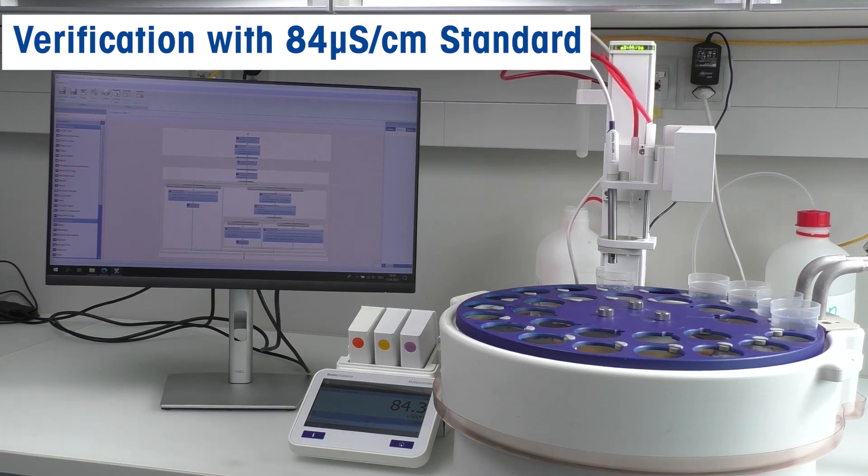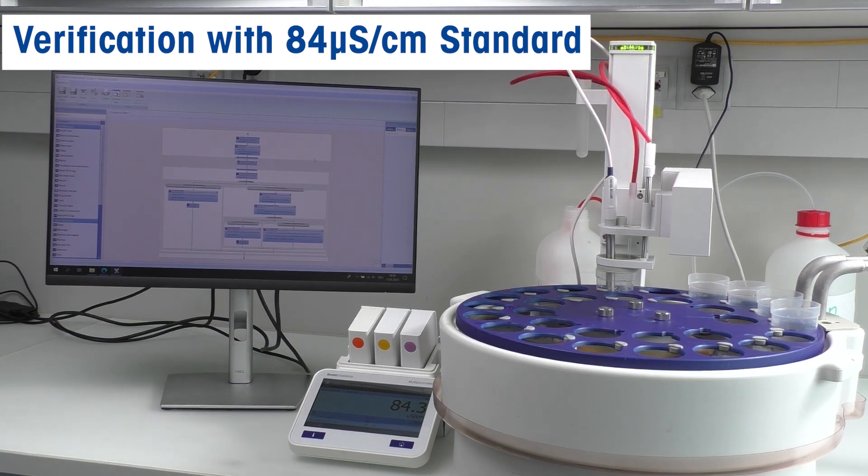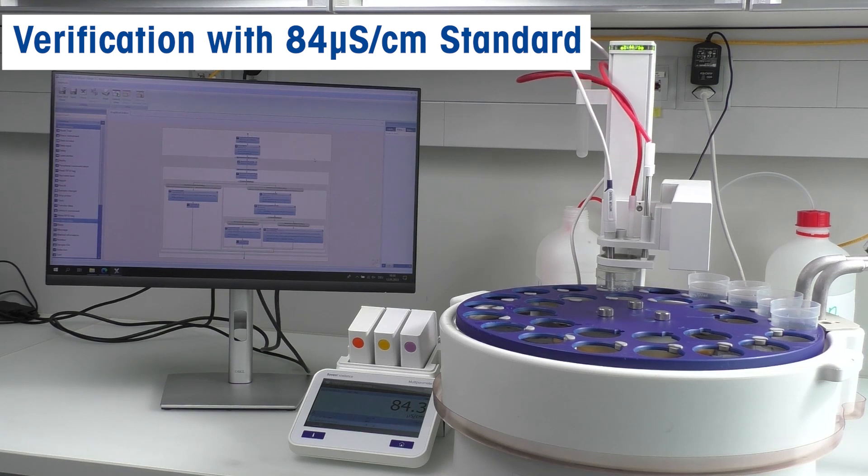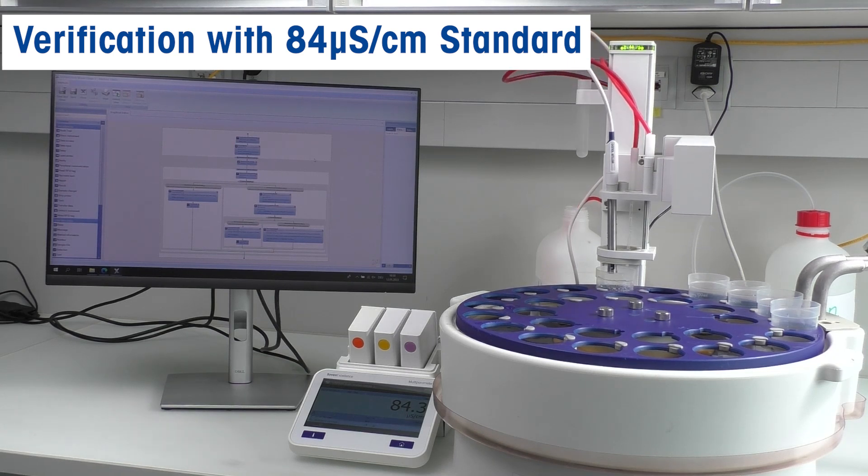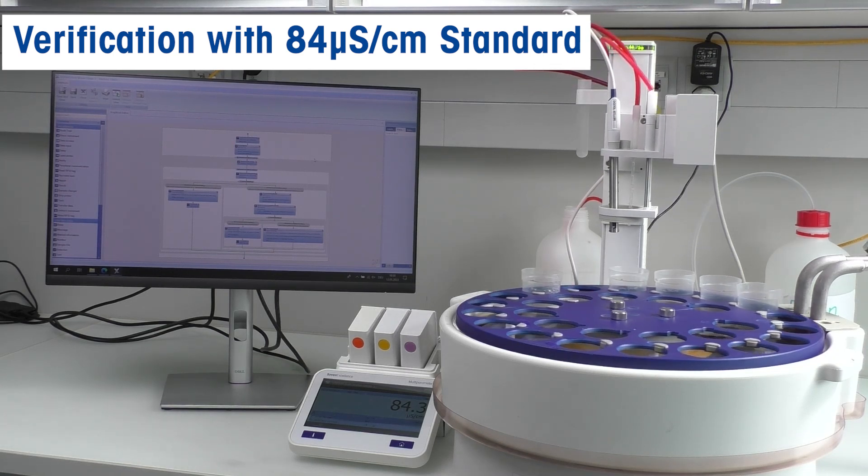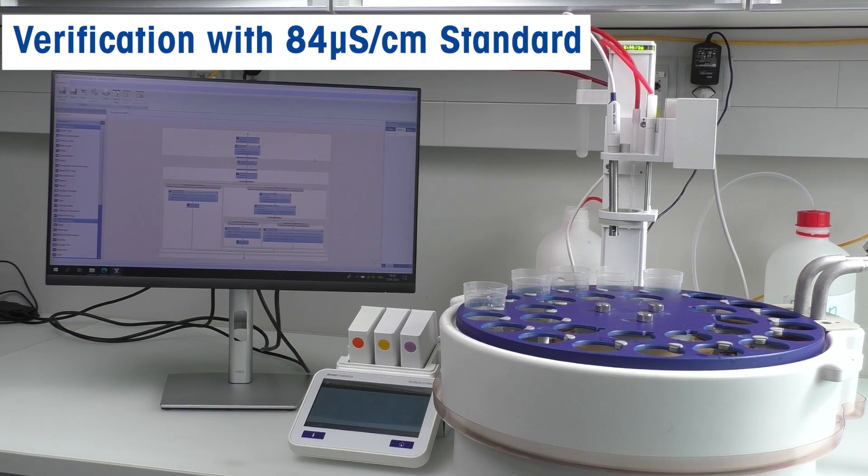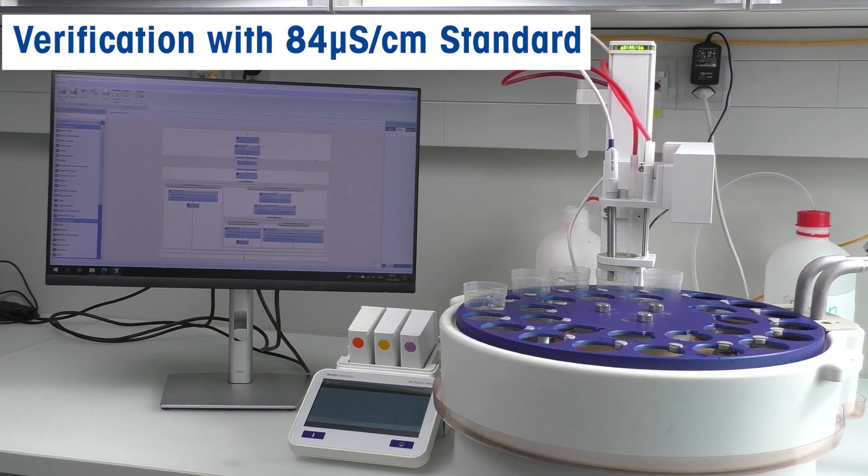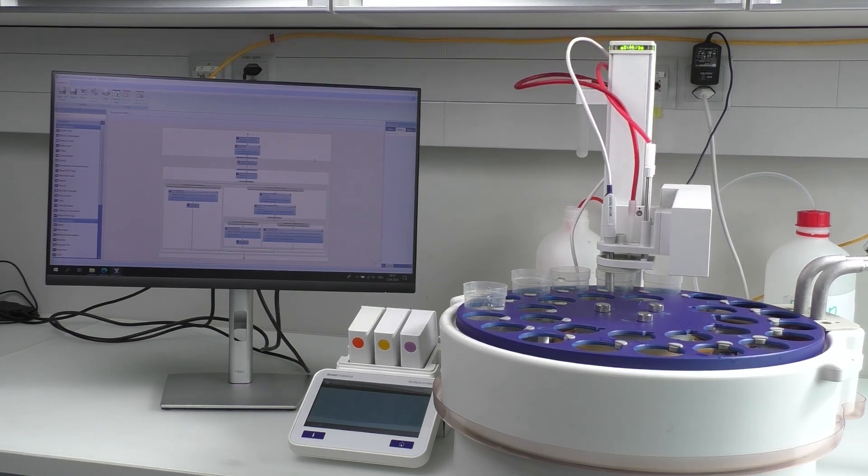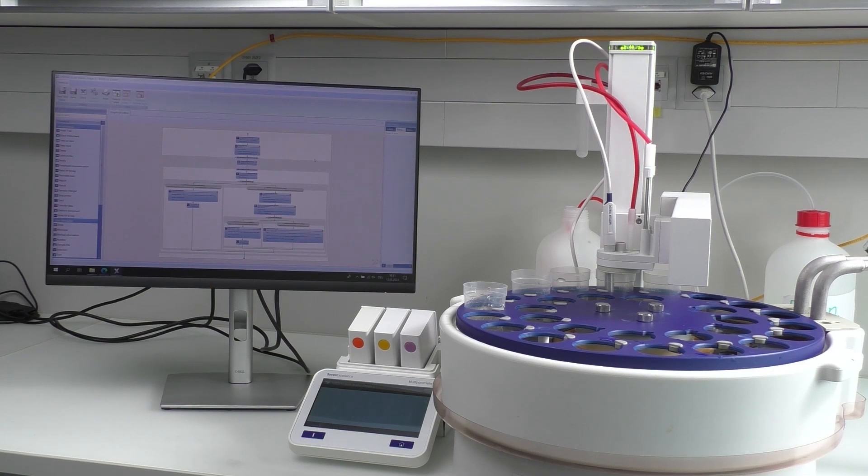The reading must be within plus or minus two percent of the real conductivity value stated in the solution certificate of the specific lot. As we are using the automated workflow, the comparison with the buffer table is done automatically in the system. After passing the verification, we can start measuring samples.